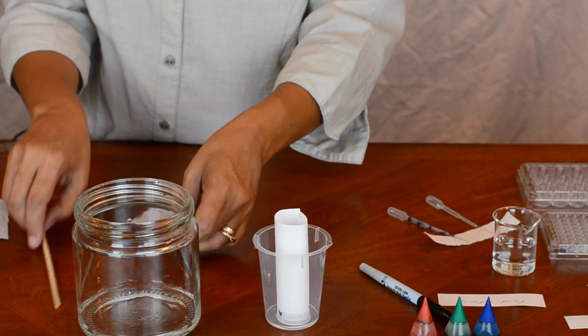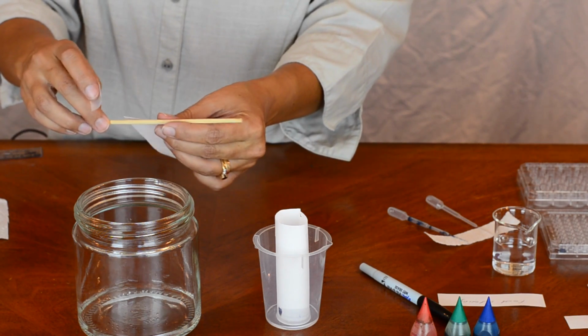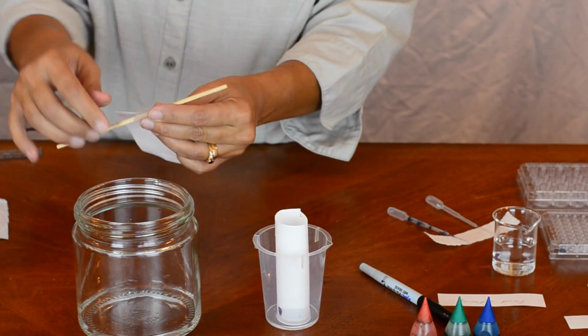And I'm going to do the same thing with my second paper. Grab another piece of tape. I've already checked that the length of this paper is the right length to hang off of my dowel, so I'm just going to put a piece of tape on the dowel.